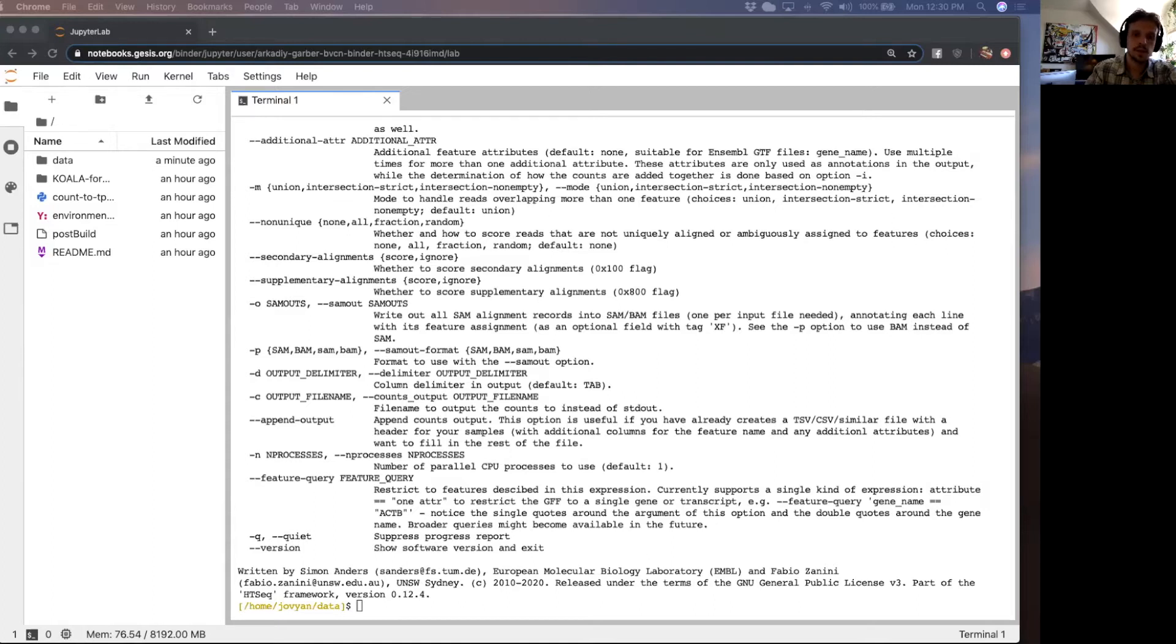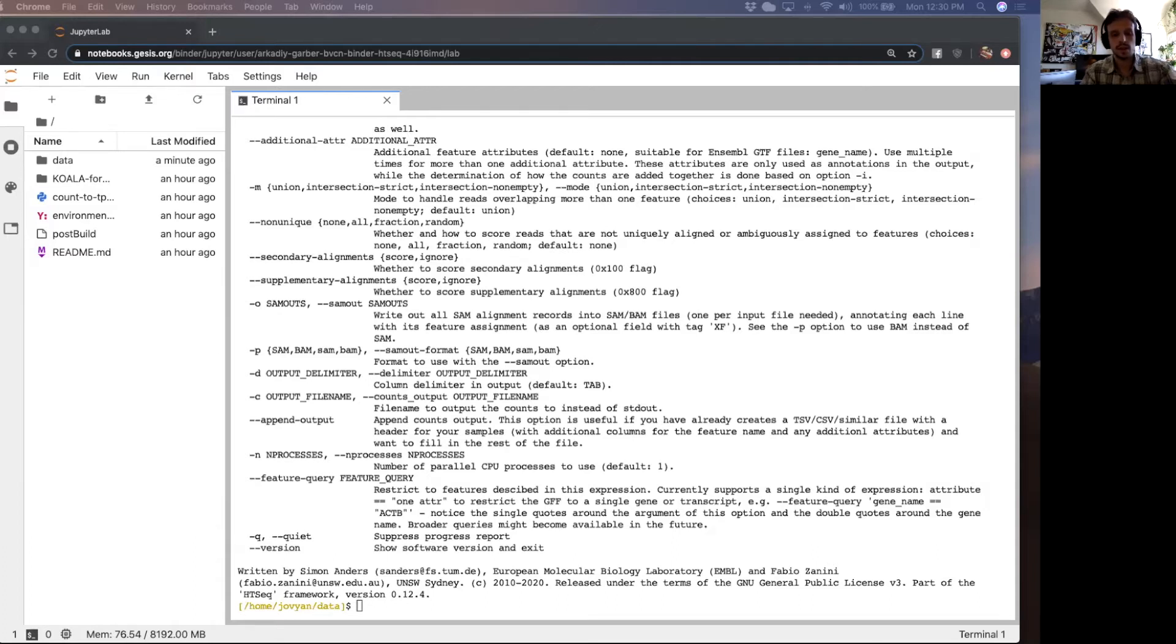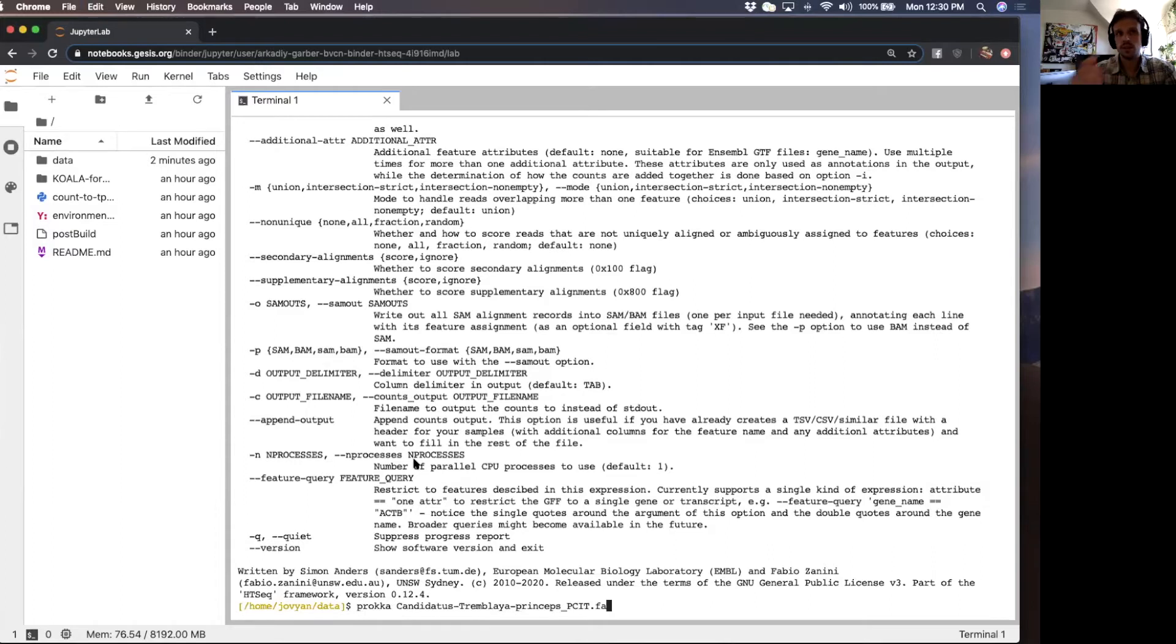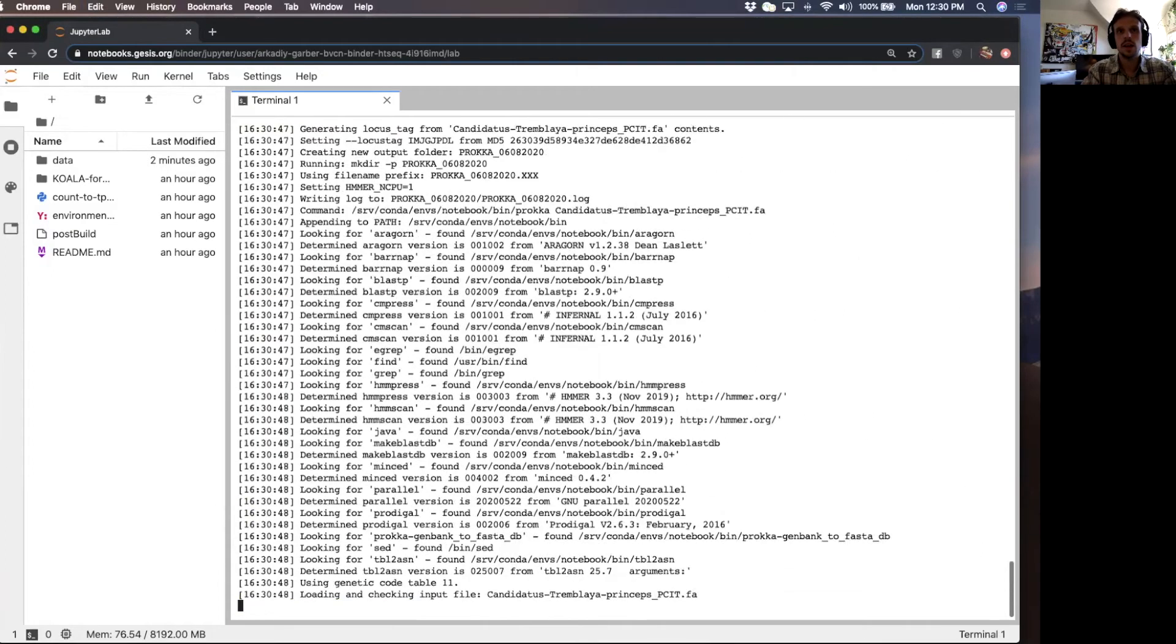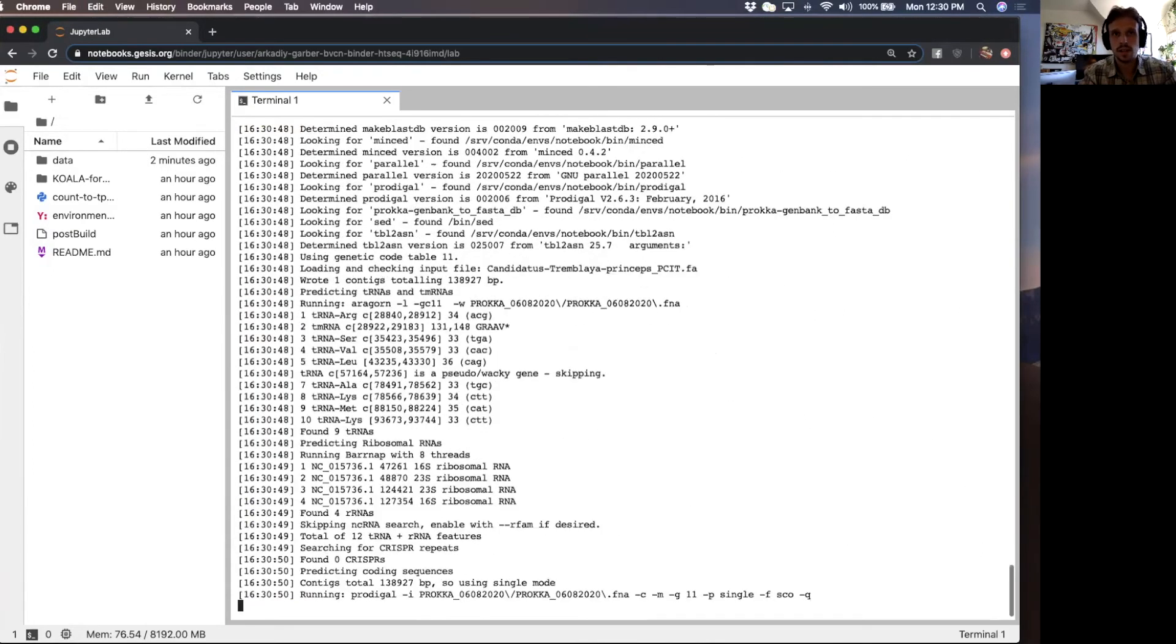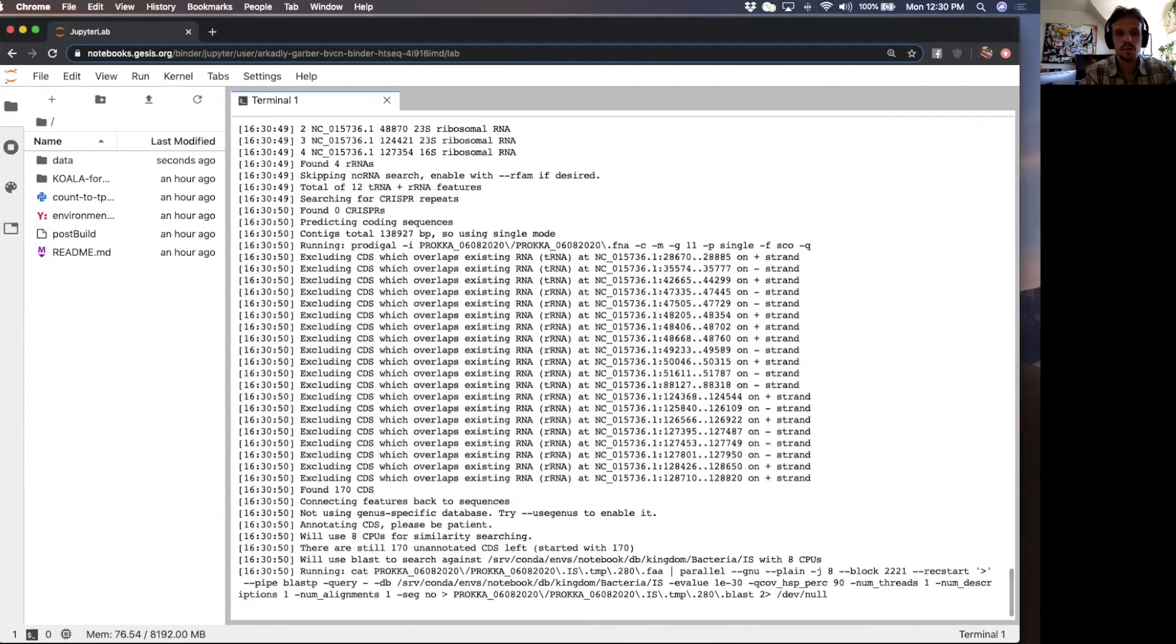If you want to refer back to that lesson, you can learn about how to make a GFF file. Another lesson that is upcoming is Proca. I'm going to basically use Proca here to generate the GFF file that we need without talking too much about how Proca works because there will be a dedicated lesson for Proca.